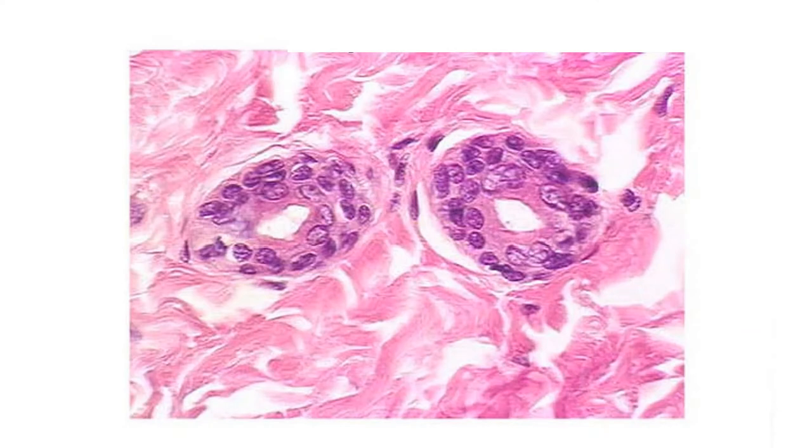Okay, a couple we see on this image. Let's deal with the soda straw first, but it's not a normal soda straw, is it? It looks a little crowded in there. There's more than one layer of cells. So this is the very rare stratified cuboidal, the one that's not usually asked on exams. Location is ducts, and that's what we're seeing here, some duct, some tube, and we're looking down the lumens. So it is a soda straw image, but it's multiple layers of cuboidal cells, stratified cuboidal epithelium. Around it, out here, looks nice and marbled, doesn't it? If we see the marbling, that's dense irregular connective tissue.